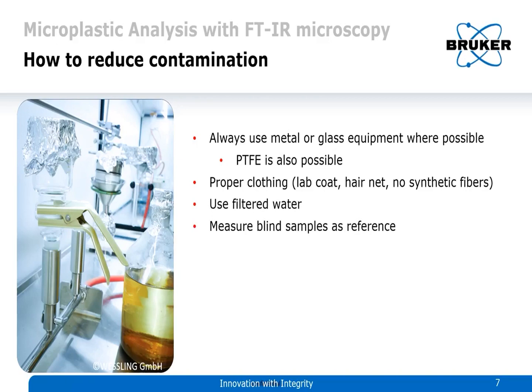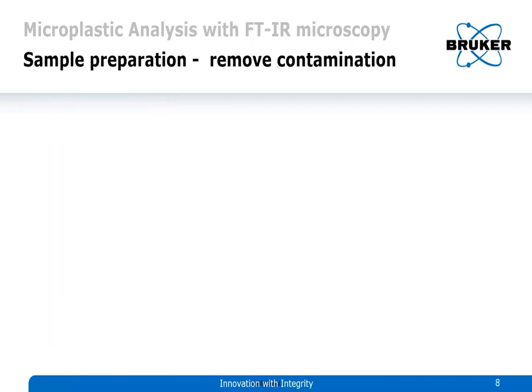So just measure the empty filters to know what is your baseline on particles that you will get, which you have to subtract later, and then filter your lab water without any sample to see how much contamination or how many particles you may add to this to get a baseline.